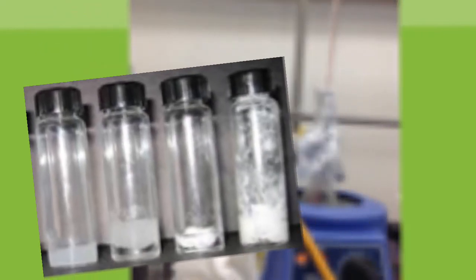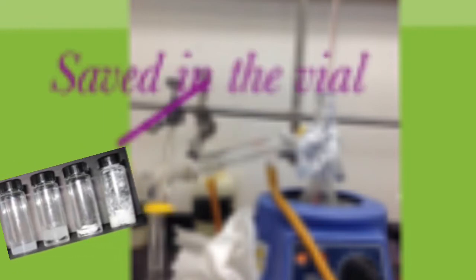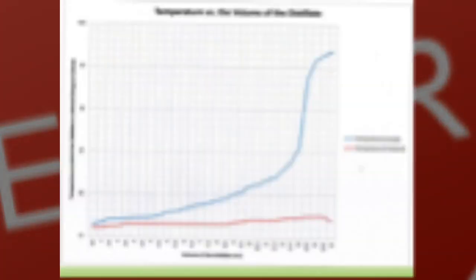The first 1 milliliter of each distillate was to be saved for further testing. So during the collecting and saving of the first 1 milliliter, some drops are wasted and the data might be off when you're marking the 5 milliliter mark for the temperatures. This factor might cause the data to have some errors.